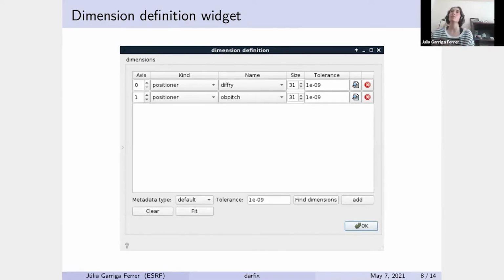When you mean pseudo motors, you mean the step size is the same for both? No. What I mean is that this pseudo motor would have a fixed step size, but the sub motors that define the pseudo motor would have different sub step sizes. So the overall number of steps is the same, but each step size for these motors would be different. Could that be possible somehow?